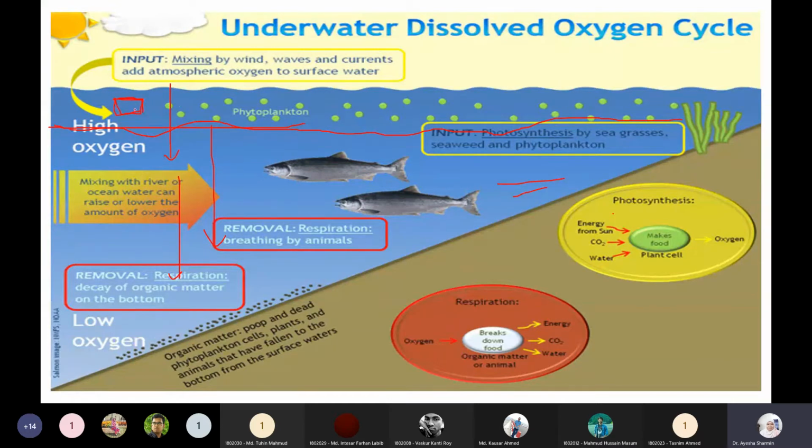So you not only calculate the dissolved oxygen content, but sometimes we take the dissolved oxygen amount over time, say for a 5-day period, one day after another, and see how much change is happening if you think some plankton is present in the water body, and how much of them are present. That is also important for water quality.